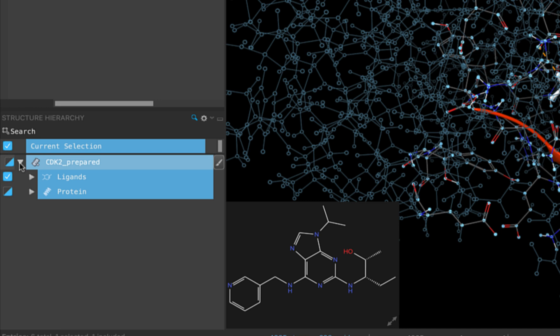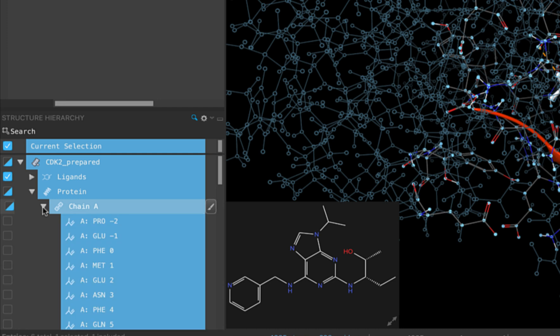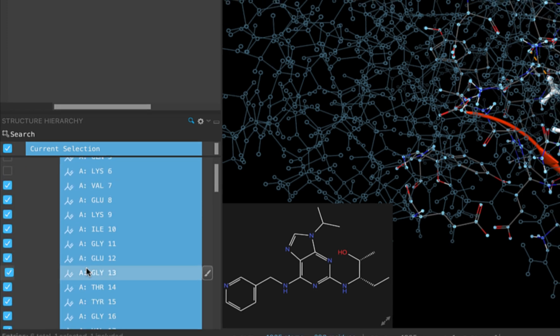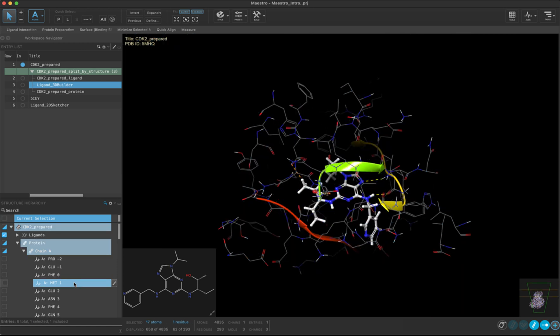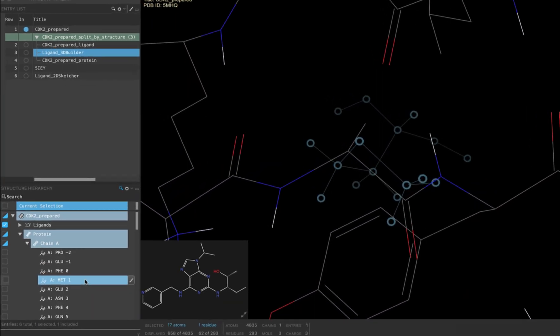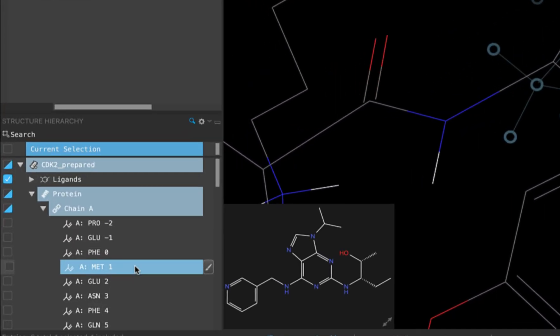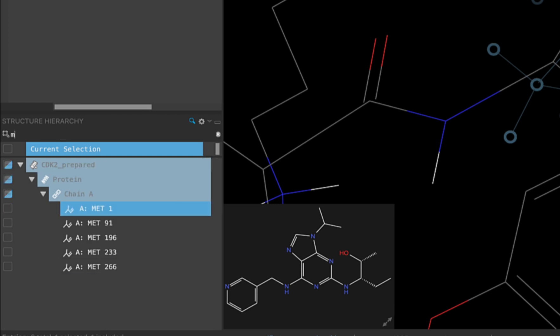If we click on the arrow next to the protein, and then the arrow next to chain A, you can see all of the residues within that chain. If you select and double click one of the residues, it will zoom you to that residue. You can also use the search feature in the structure hierarchy to find a residue by its name or number.